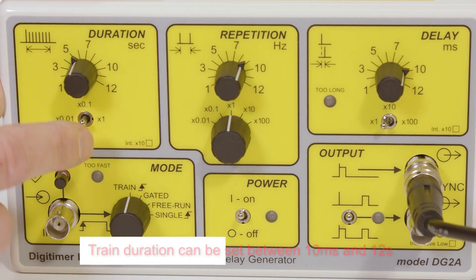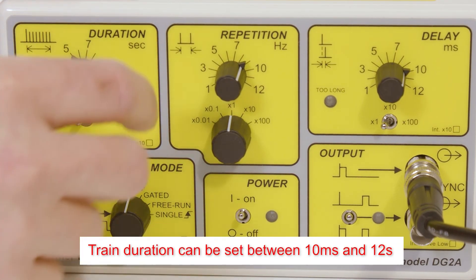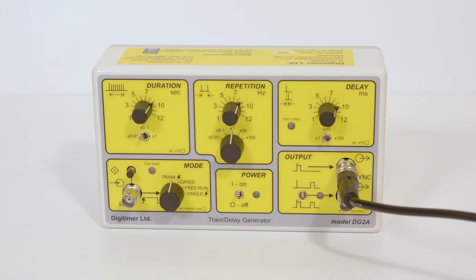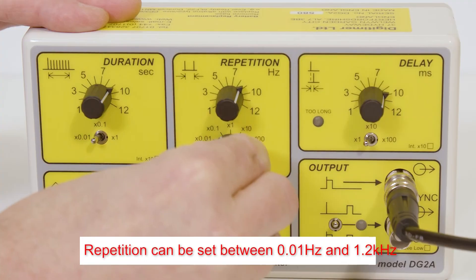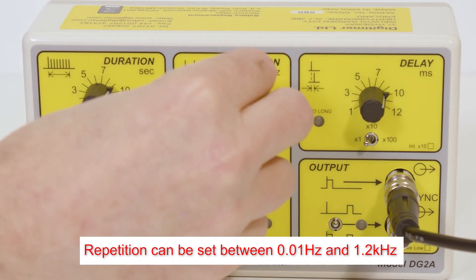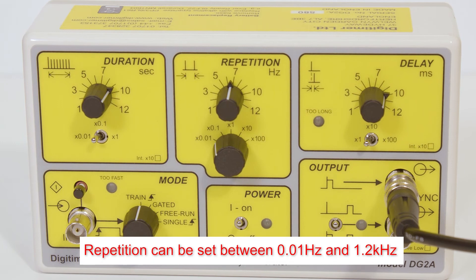In train mode, the duration controls allow the operator to set the train duration between 10ms and 12 seconds. In all modes except single, the repetition control allows the user to set the output frequency between 0.01 and 1200Hz.